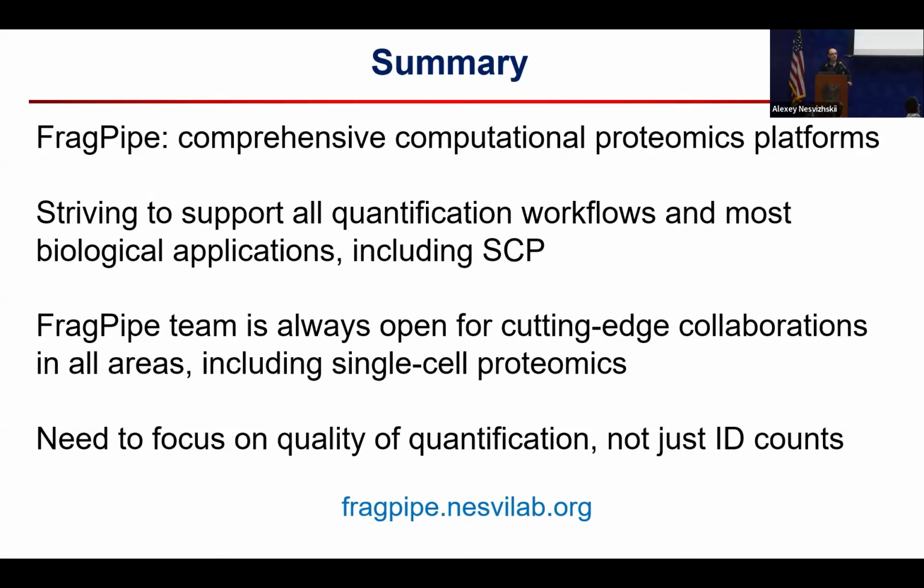How to deal with shared peptides, like how this tool will consider these shared peptides and how to give weightage for this. Oh, this is my favorite paper, and it's 20 years now that I wrote a paper called the protein inference problem, right? That talks exactly about that. So we use a tool called ProteinProphet in our pipeline. Again, no matter what, whether it's DIA, DDA, SILAC, whatever, everything goes through ProteinProphet, and we assign peptides to proteins with most evidence through the ProteinProphet algorithm. And that's how we approach that.